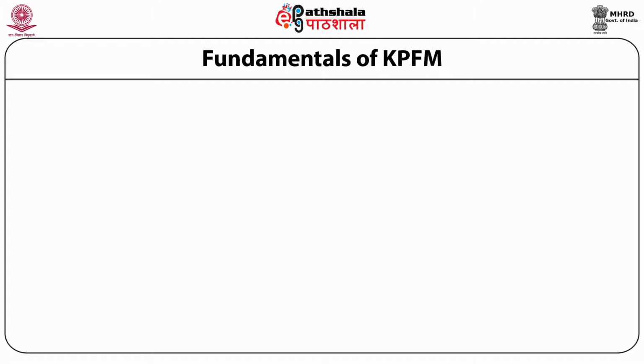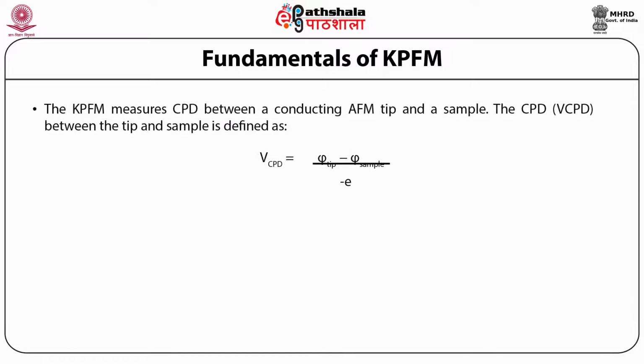The fundamentals of KPFM. In the earlier slide, a flow chart diagram of KPFM was given, which makes it clear the way it is conducted for measurement. In this slide, we talk about fundamentals of KPFM. The KPFM measures CPD between a conducting AFM tip and a sample.